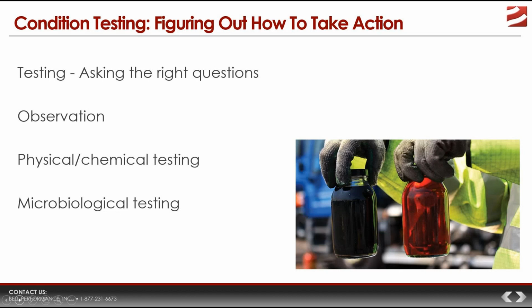Now that we have what we hope are good and accurate samples, our goal now is to get the samples to tell us the right story, which means we have to ask the right questions. That is kind of a fancy way of saying that we need to have the right testing approach to figure out what the samples tell us about where they came from.